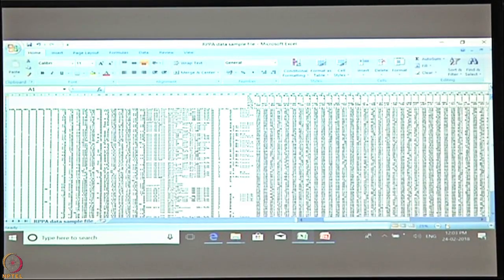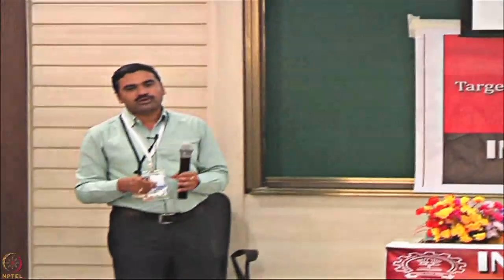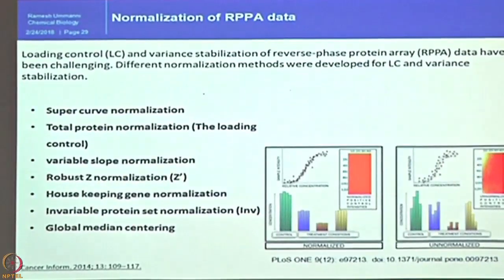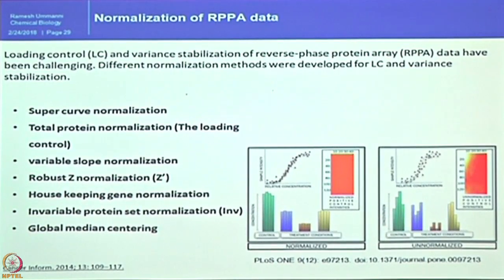So, if you load this data into commercially available software, as per the pre-designed analysis part, you will get the data output, but you cannot get the information you want from your samples according to your experimental requirements. So, when you have such a high-end data set, you need to worry about how correct the experiment is or not.